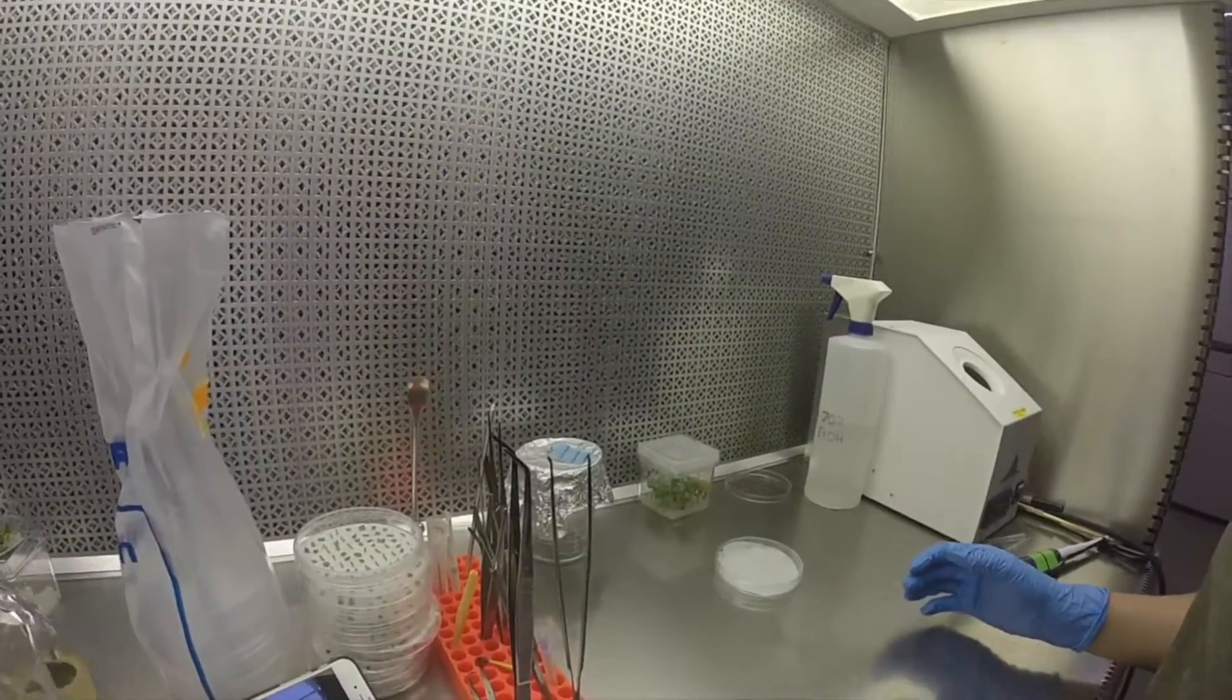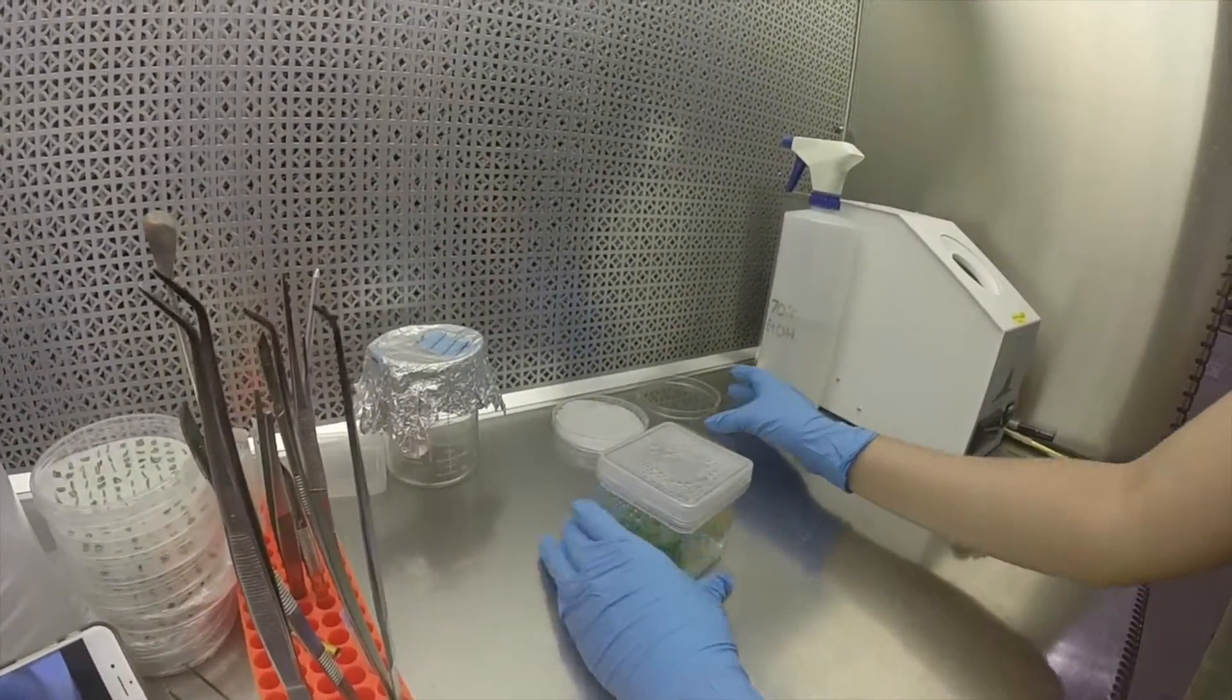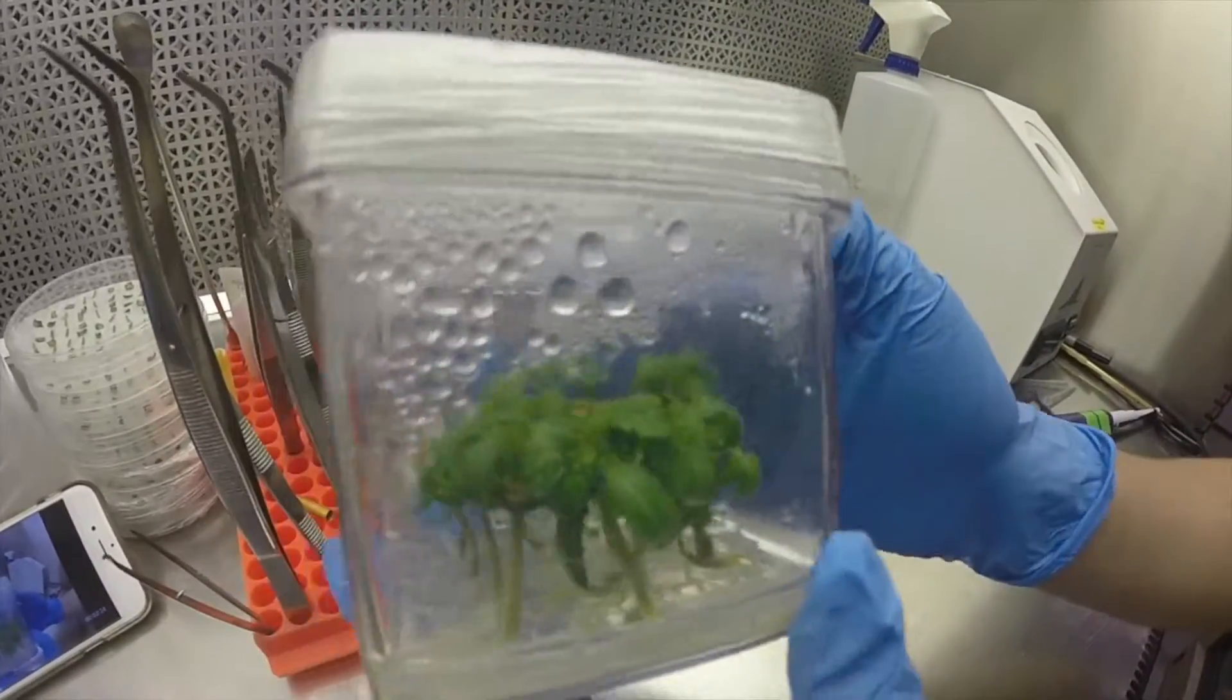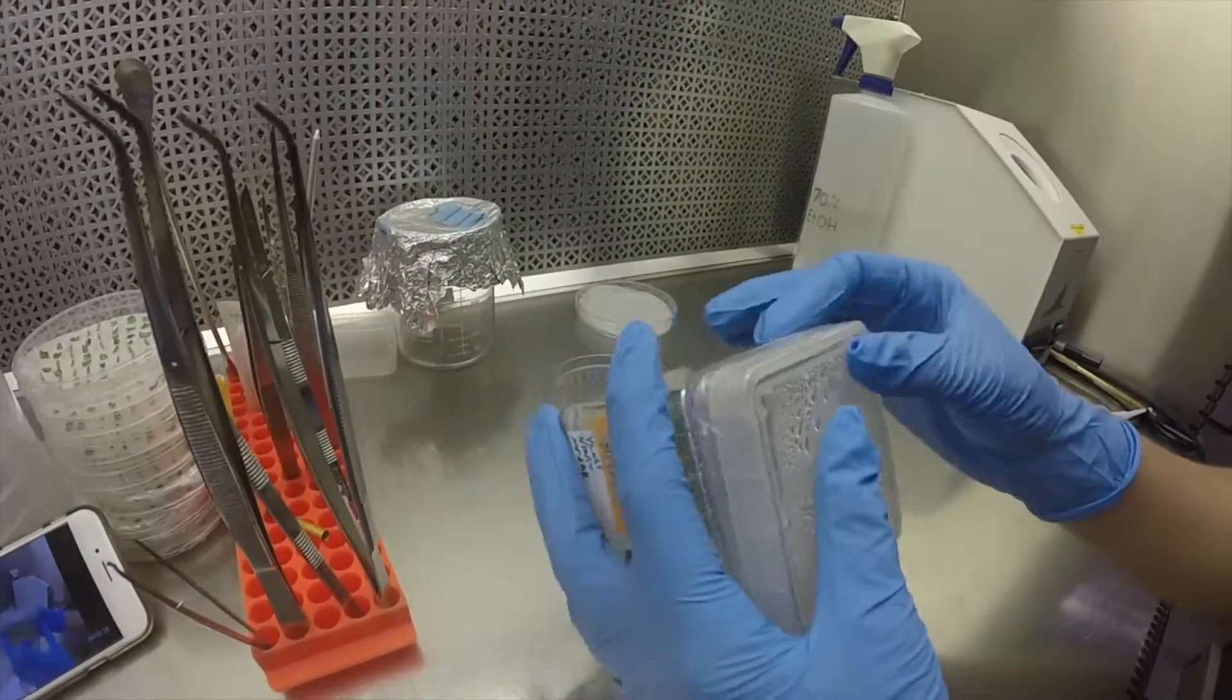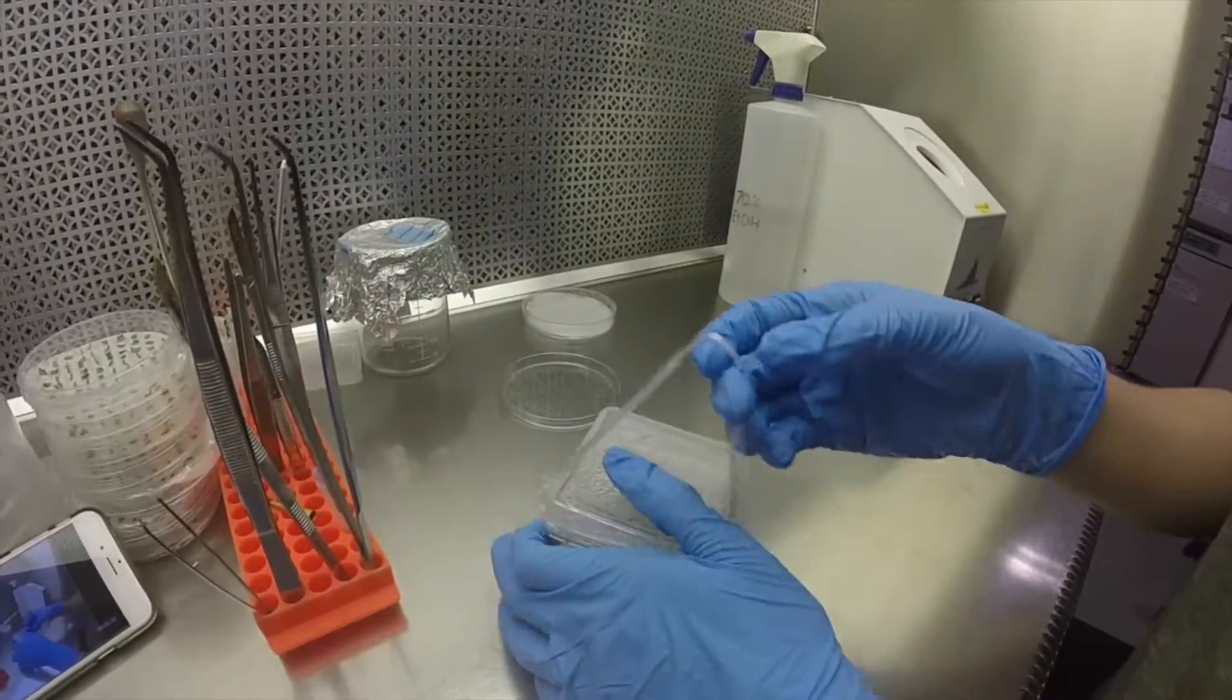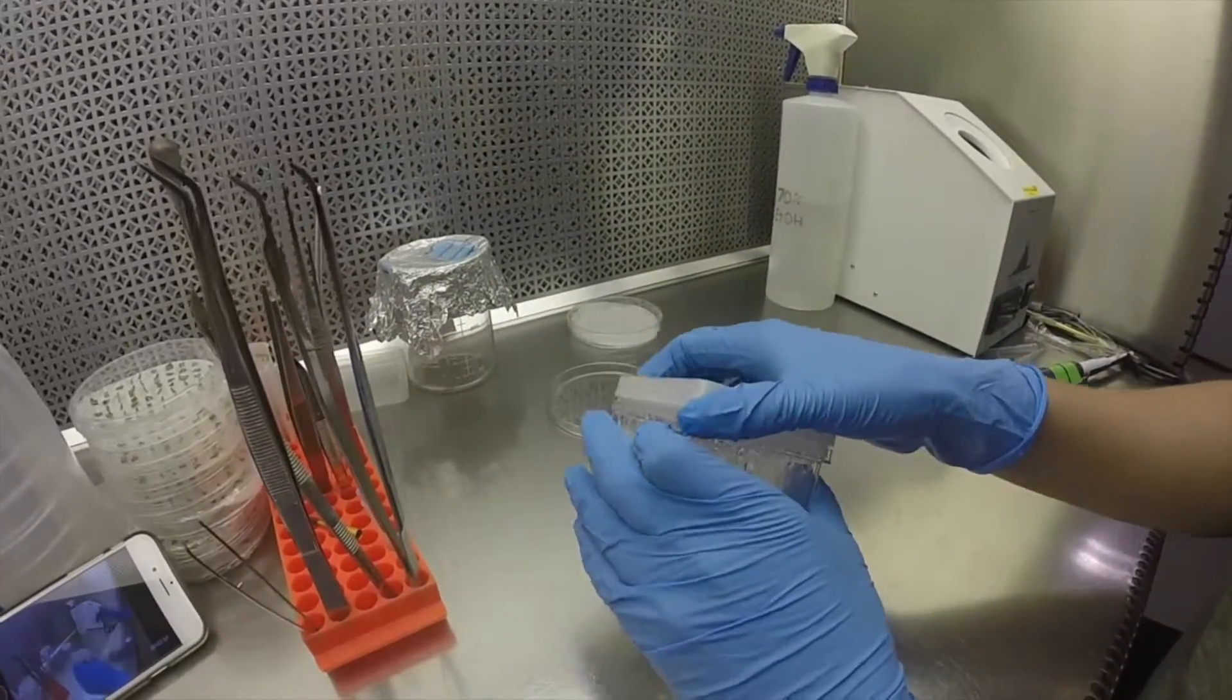Now we set all of those to the side and we're going to get into cutting. Here we have our tomato cotyledons. These are sterile tomato plants that have been growing for two weeks. They were sterilized via a procedure that I've also written up if anybody needs to look at that.